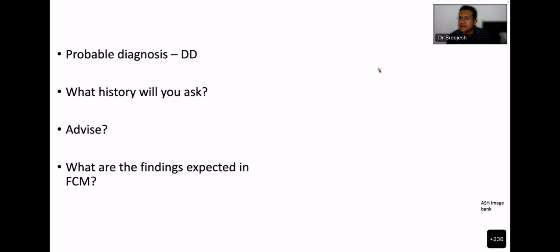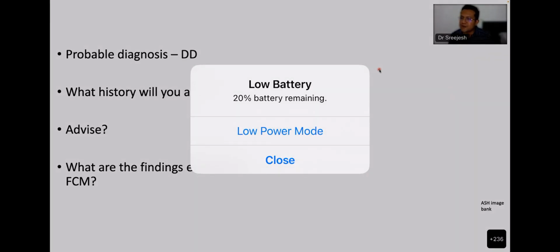Anyone else? Does any of you see flow plots? Do you have the opportunity to see flow plots? CD30. Anyone else, please? Mehak, do you have flow cytometry? Yes, sir. So before describing the phenotype, what is the appearance in APML?